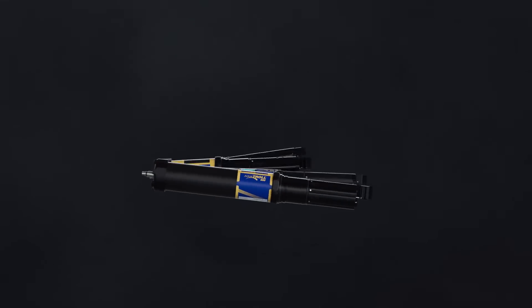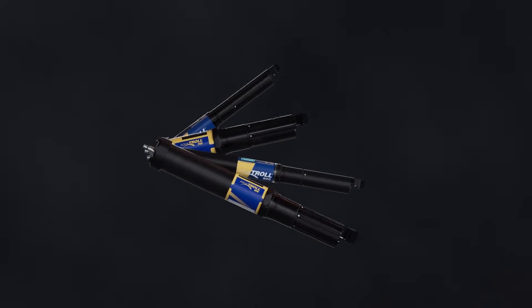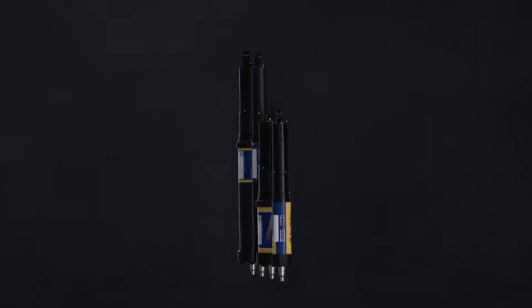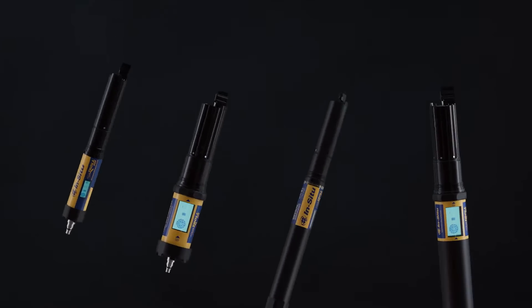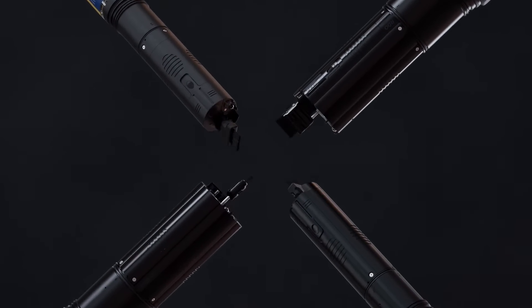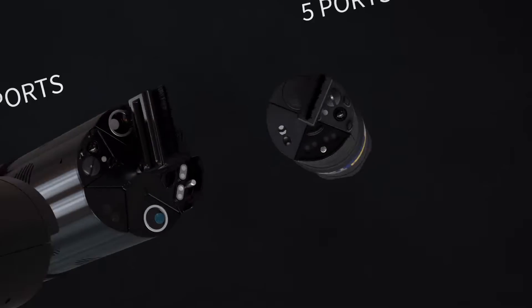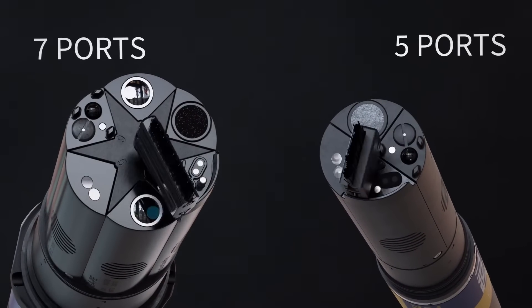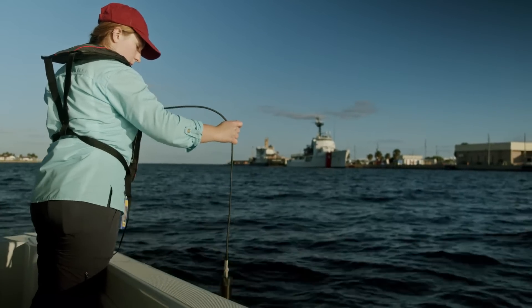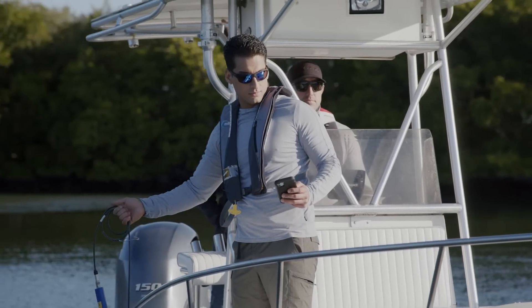Our biggest focus with designing the 700 and 800 was to make sure that it felt like it was part of the portfolio of our multi-parameter products. So if you are familiar as a user with the Aquatrol 500 and 600, you should be able to pick up the 700 and 800 and feel like you are using a product from the same portfolio. It's all about being able to create a total solution to solve customers' problems, all the way from taking a measurement in the field to getting your data at your fingertips.